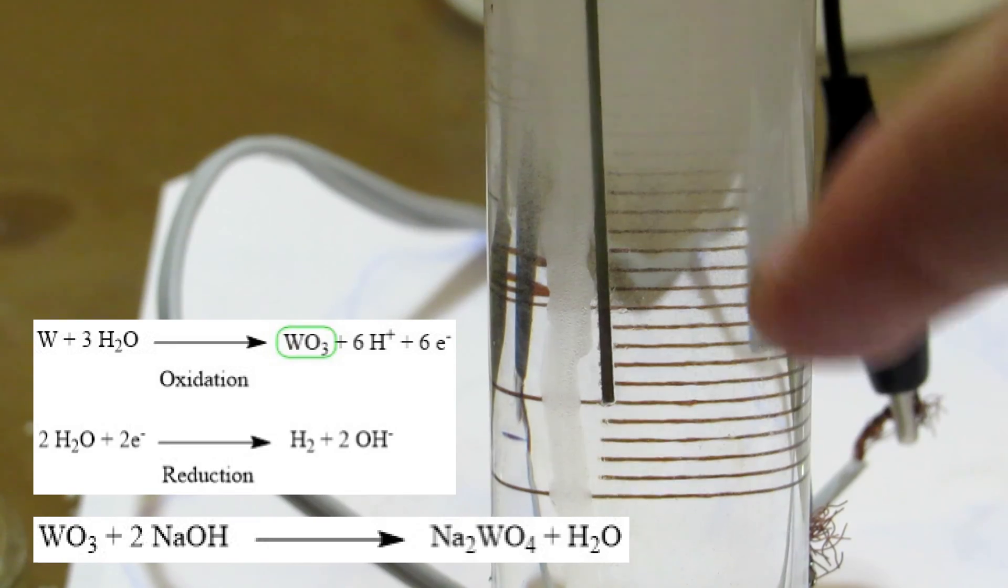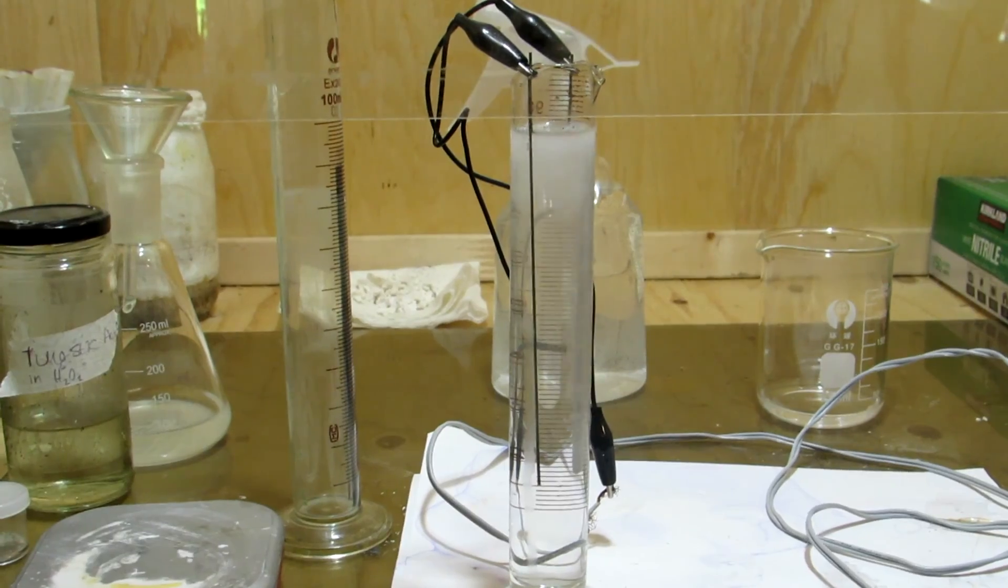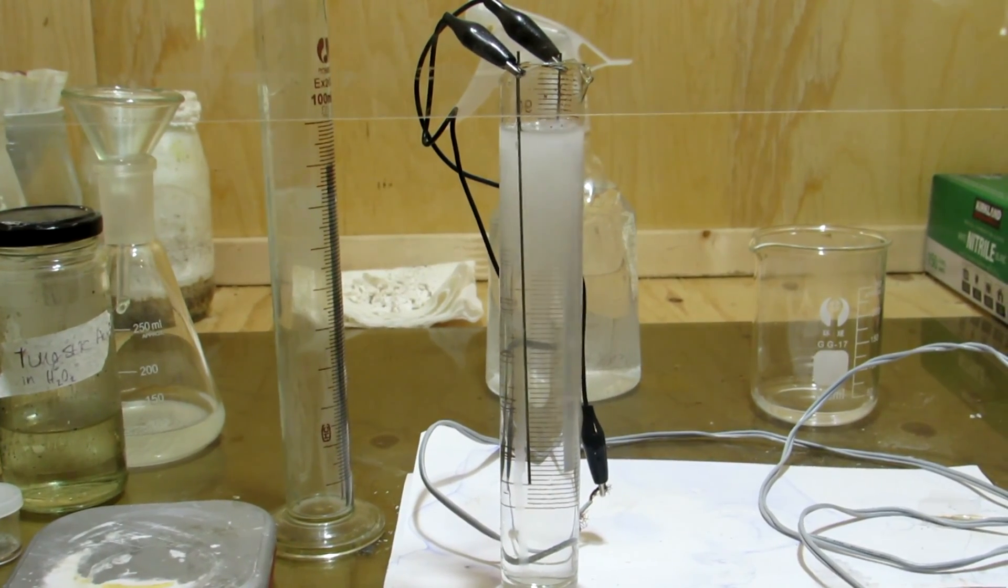As a note, only the positive electrode will dissolve, so a non-tungsten negative electrode can be used. As the rod dissolves, the thorium dioxide falls to the bottom and settles.